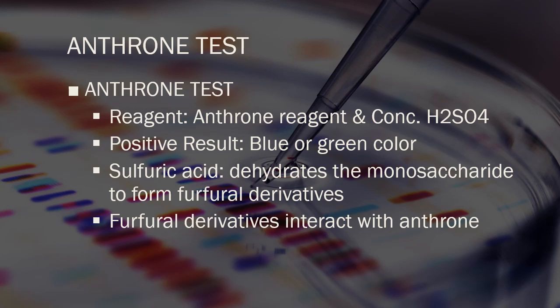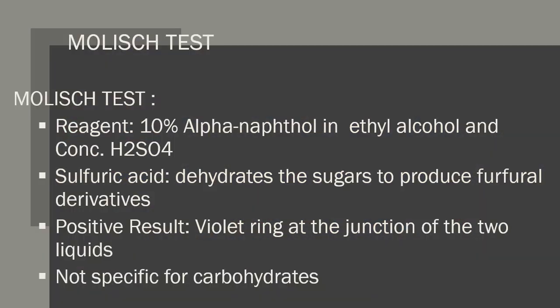Of course, since it has glycolipids present, it will give you a positive test. The positive test for anthrone is the production of a blue or green color. Okay, moving on to your Molisch test. This is what you performed in the laboratory for your glycolipid test under your lipids from the brain experiment. All carbohydrates should give a positive result for this one.